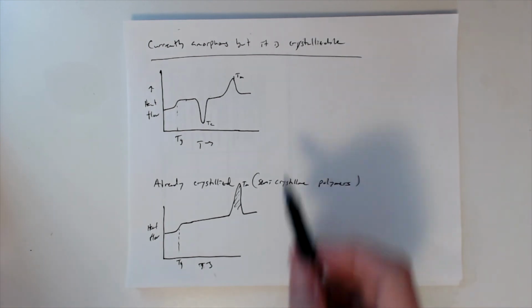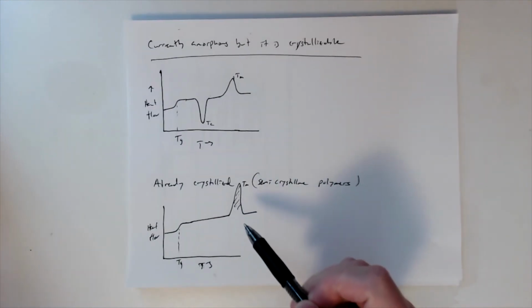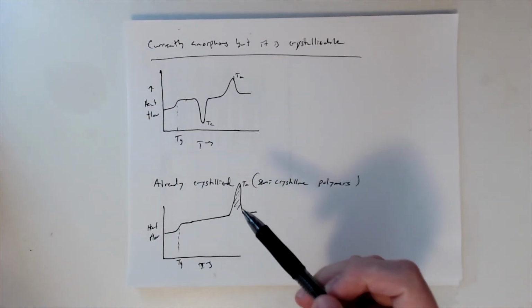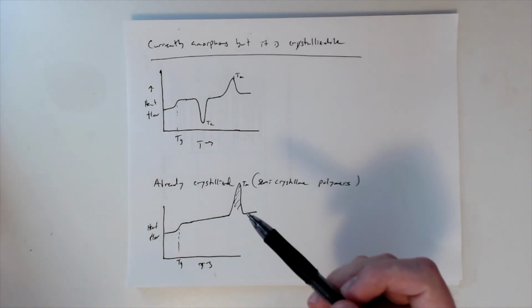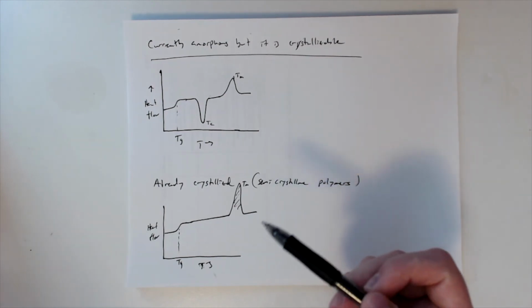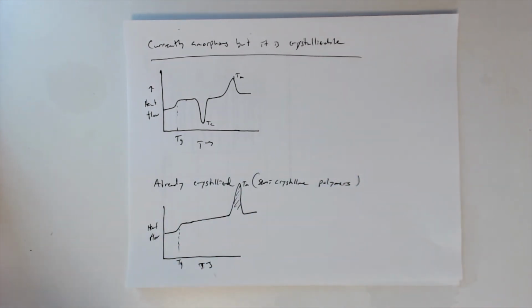And the reason I bring this up is because these experiments tell us about the crystallization, and in essence we can figure out how crystalline something is. So we can figure out that percent. So how much crystalline phase, how much amorphous phase, and that's really important for polymers. Some polymers, the only difference there is the amount of crystallization. Low density versus high density polyethylene, the only thing that separates those, other than the basic structure, is how much they can crystallize. And so this is an important characteristic.